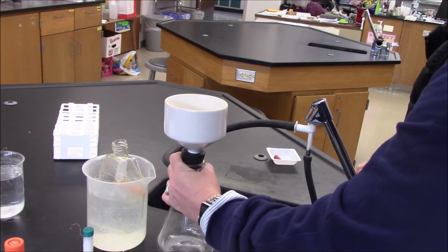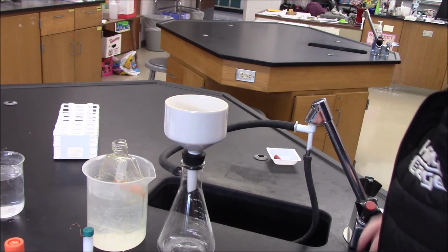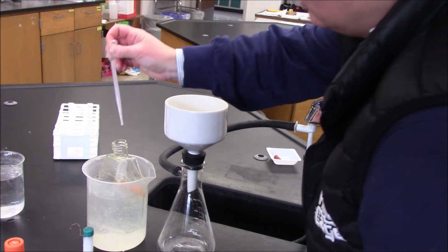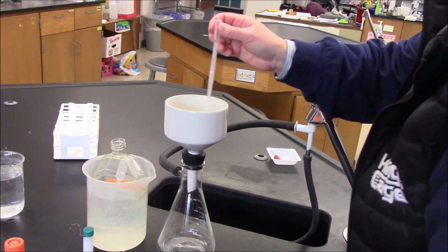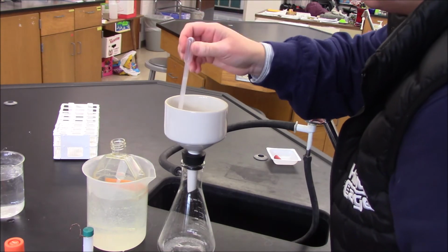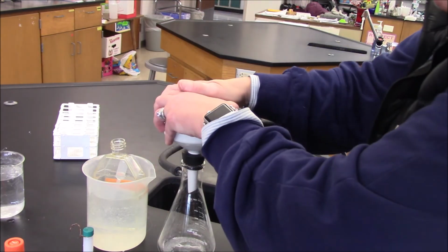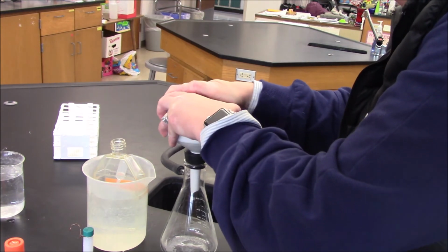Turn my water on high. The first thing that I'm going to do is wet my filter paper with cold water. And hopefully I'm going to get some form of suction here. This is so hard to do.